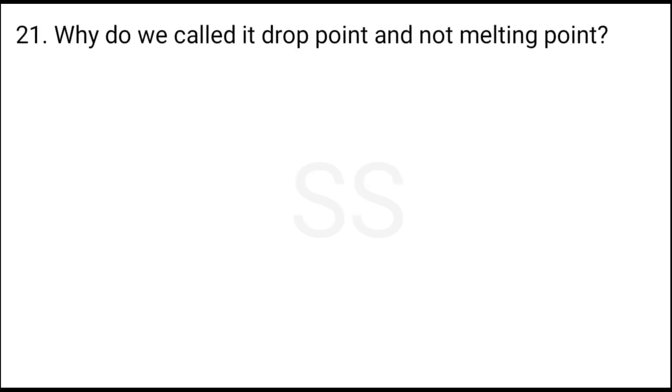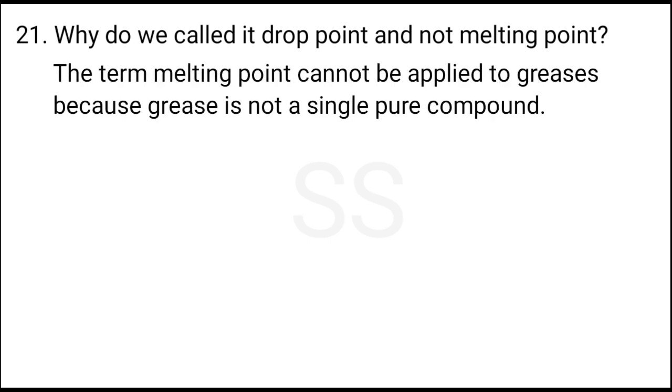Why do we call it drop point and not melting point? The term melting point cannot be applied to greases because grease is not a single pure compound. Instead, the term dropping point is used to define the temperature at which grease passes to a liquid state, either by melting or separation of the oil phase.